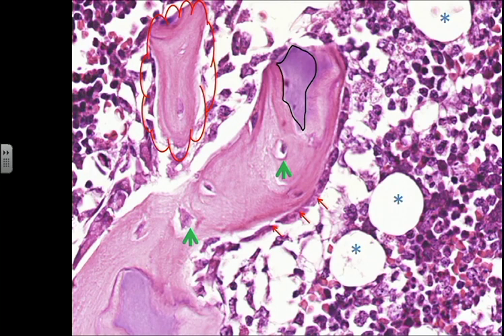Like pathologists, when they receive any tissue, it comes as soft or even bone hard tissue, and they have to cut very thin sections from it. The measurement of these sections is supposed to be 3 to 4 microns, very thin sections. In order to do that, we have to transform this tissue to become more solid, or in the case of bone, become more soft but still solid, so we can have our thin slices. In order to do that, we use a lot of chemical material.